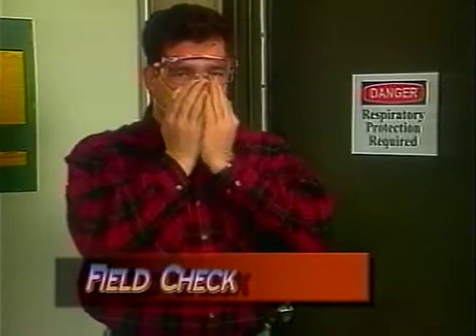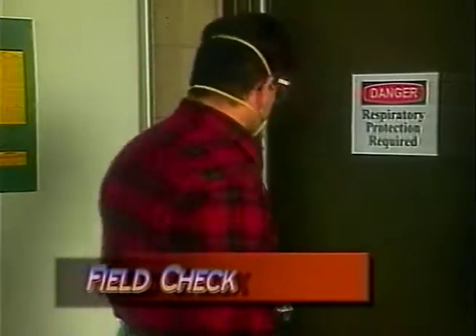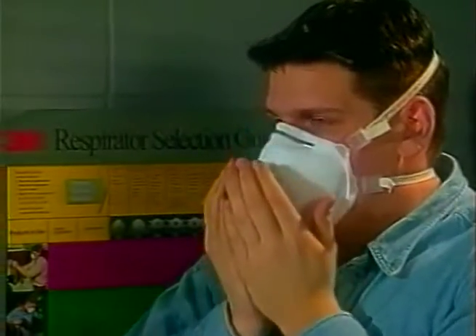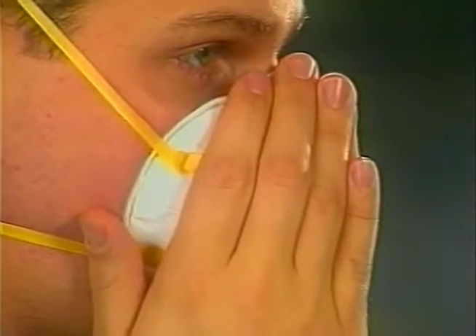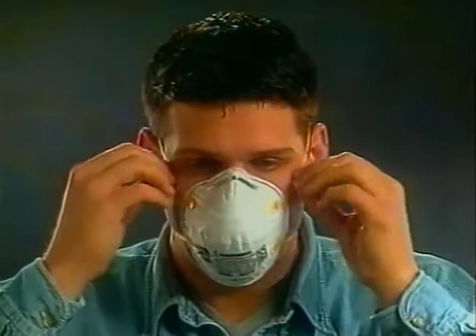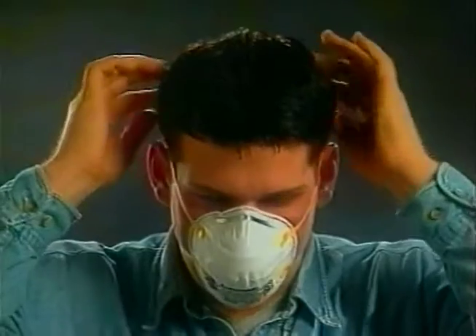After donning a disposable respirator, it is very important to carry out a field check before entering a contaminated area. The field check will let the wearer know if the respirator has a proper seal around the face. For a disposable respirator without an exhalation valve, place both hands over the respirator and exhale. The respirator should bulge slightly. If air leaks around the nose, readjust the nose piece. If the respirator leaks around the edges, work the straps back along the sides of your head or tighten the straps if they are adjustable. Repeat the checks if needed.